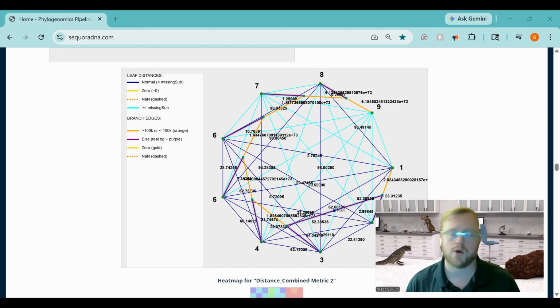That purple line means they have overlap with one another. However, for 1 and 7, there's no overlap, hence the reason they are connected using more of a cyan line. It means that all the chunks between them were unique. It means none of them passed the k-mer filter. And that affects how similar they are in terms of the calculated metrics for combined metric 1 and combined metric 2. So as promised, we're coming full circle back to that explanation.